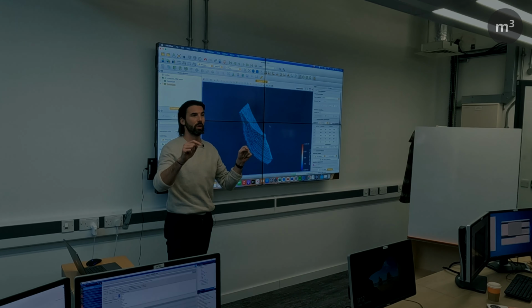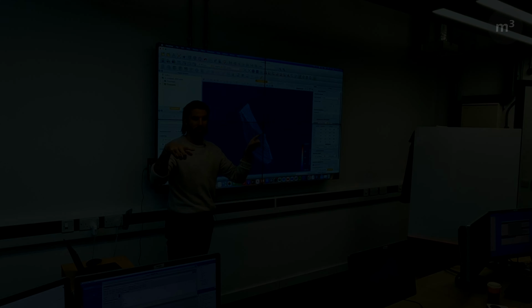So I reckon now we will run through the pipeline on each of your machines.